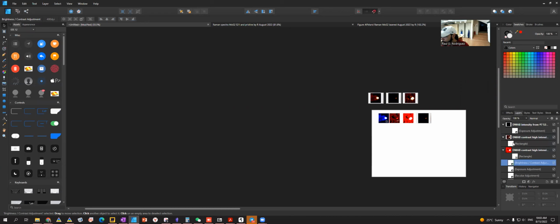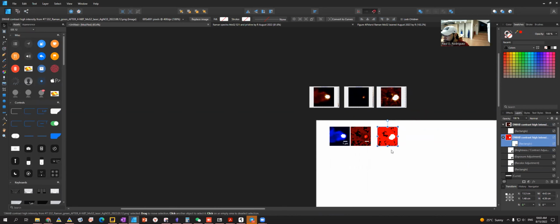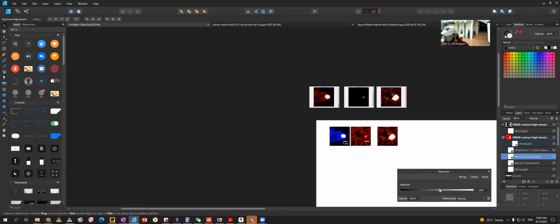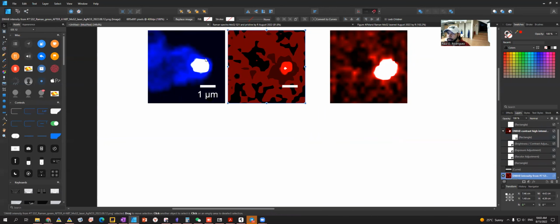Again, this one doesn't matter. Oh, it was working. Okay, now as you can see, we don't need this one anymore. It's oversaturated, so I'm going to change that. Yes, I think this one looks better than that one. The color is okay. This one looks too different from this one. This one is smoother, this one is not, this one is a little smoother.